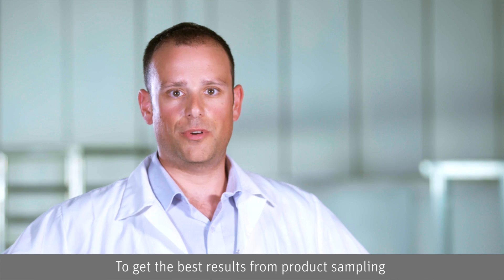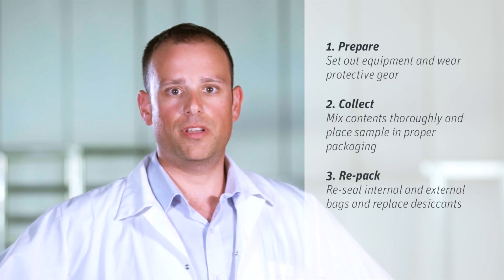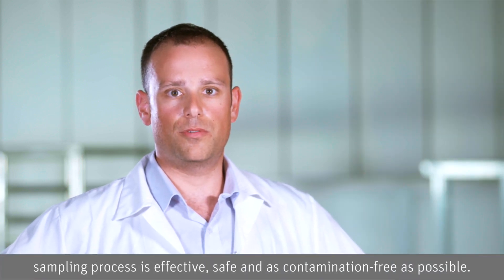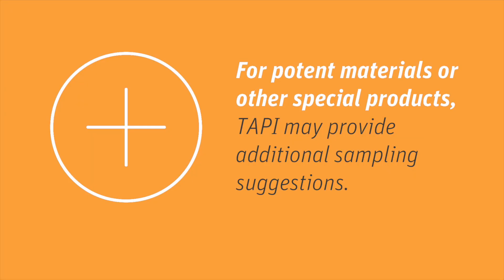To get the best results from product sampling, remember to follow these three main phases: prepare to take the sample, collect the sample, and properly repack the bulk product after the sample is taken. TAPI is your API partner. We are committed to working with you to ensure that your sampling process is effective and safe. For potent materials or other special products, TAPI may provide additional sampling suggestions.